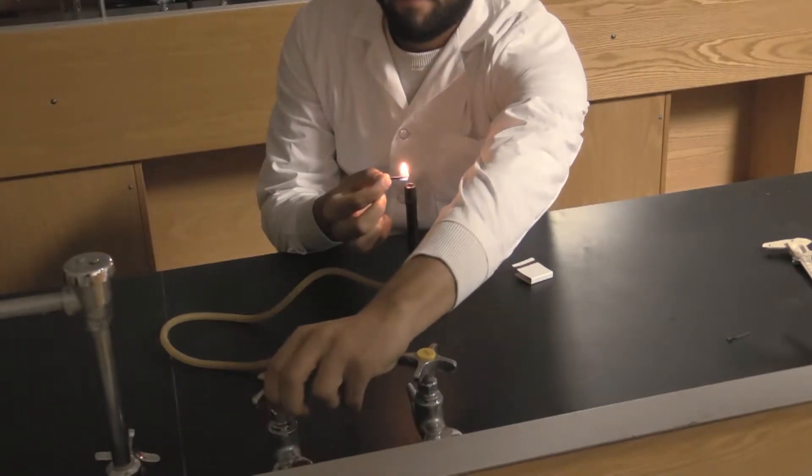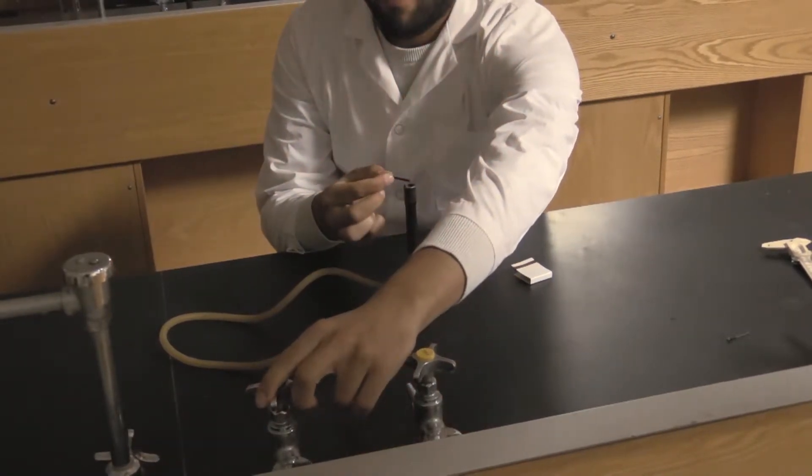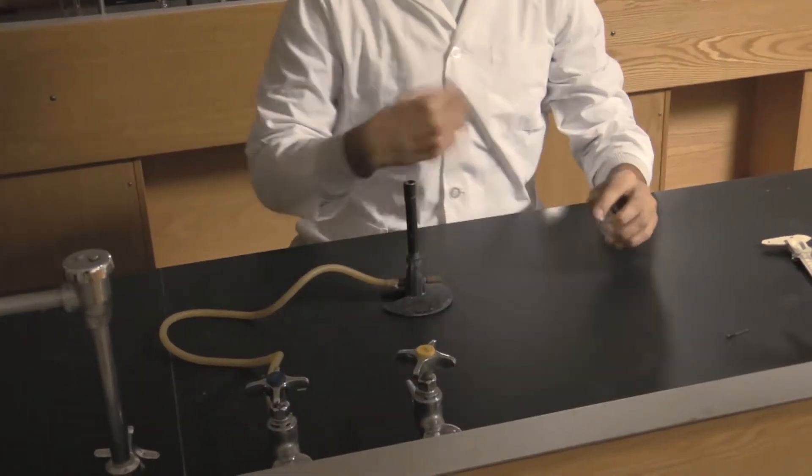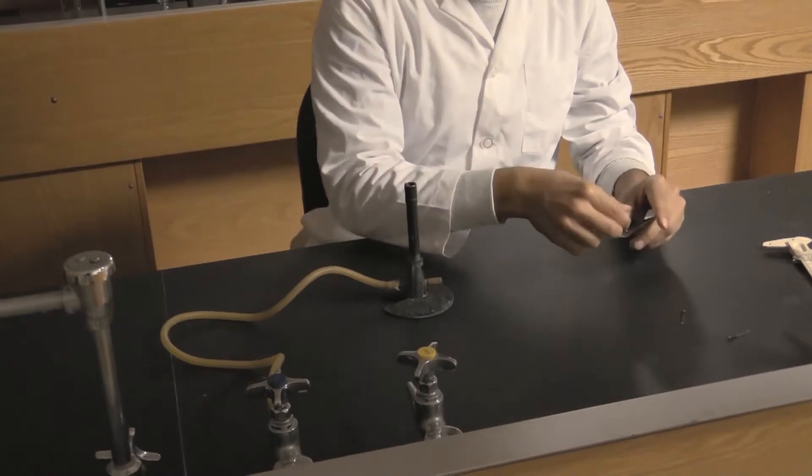Bunsen's improvement on the traditional gas burner was to allow air intake from the bottom of the barrel, near the location of the gas injection. This makes for better combustion and happier students.